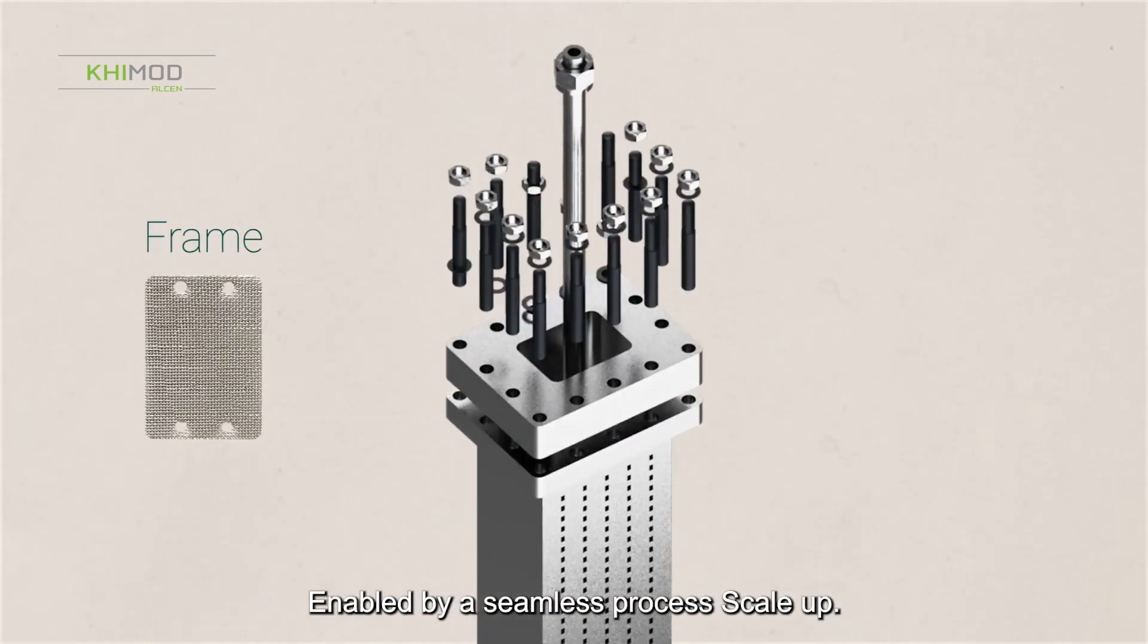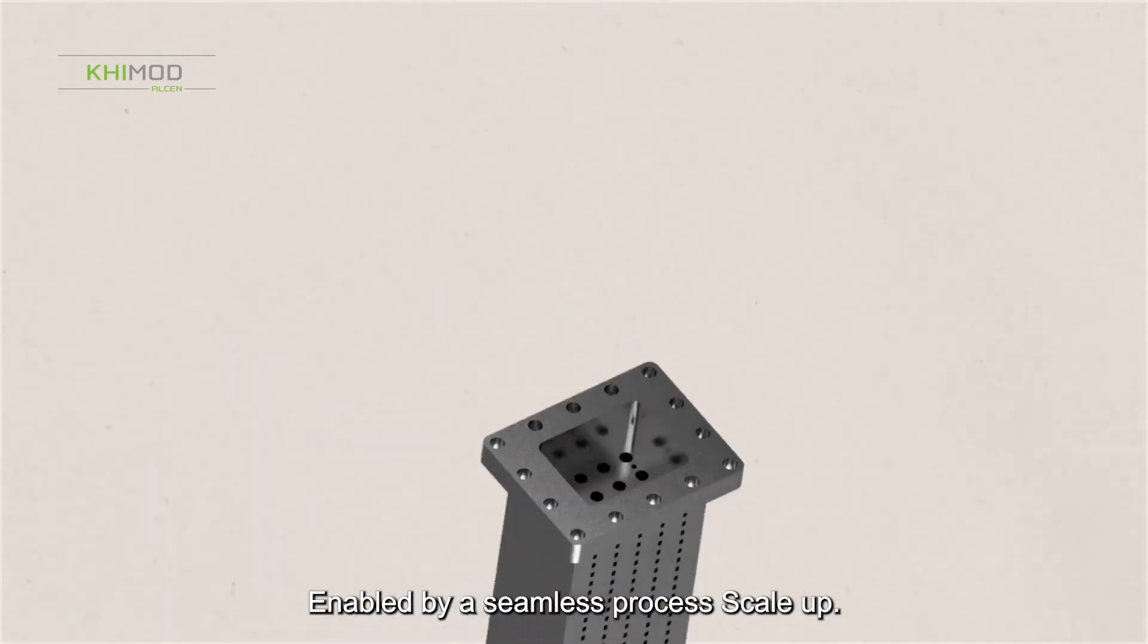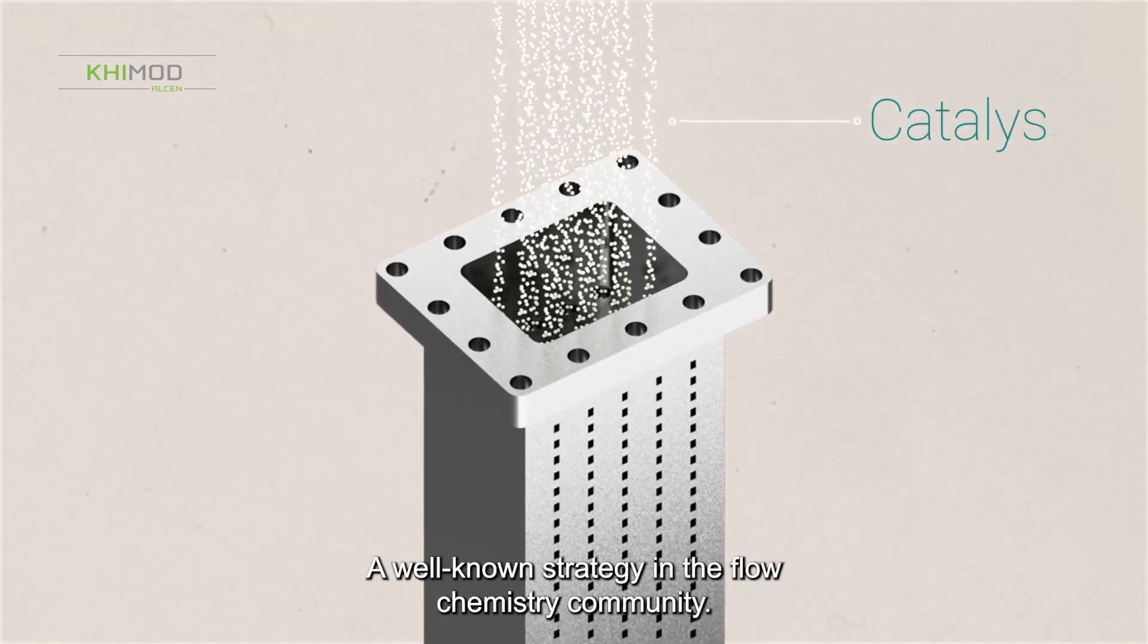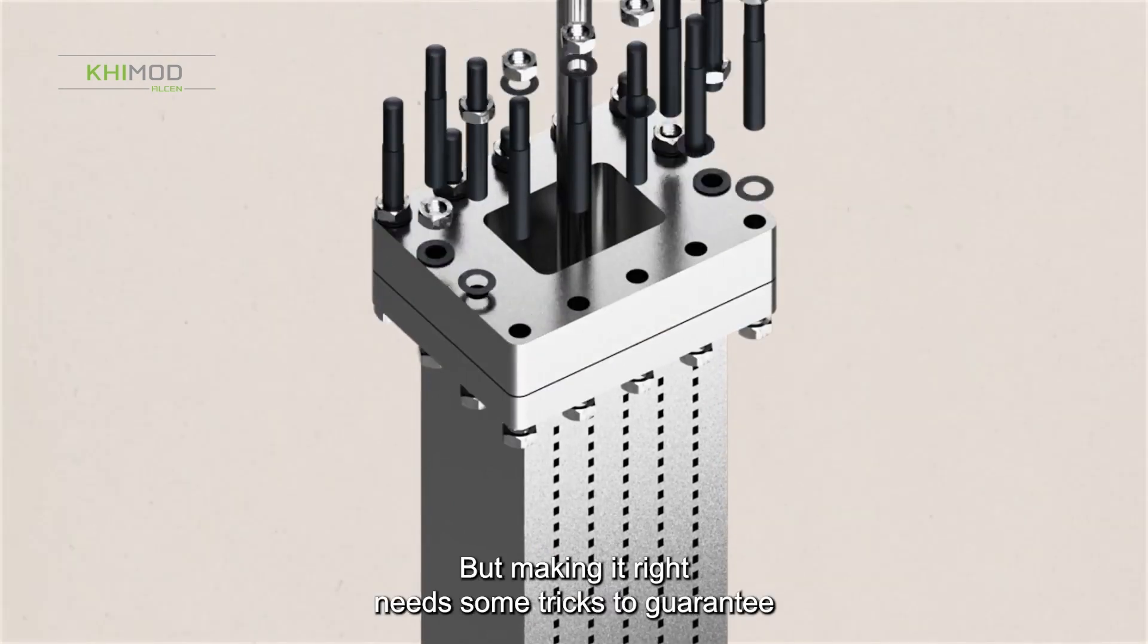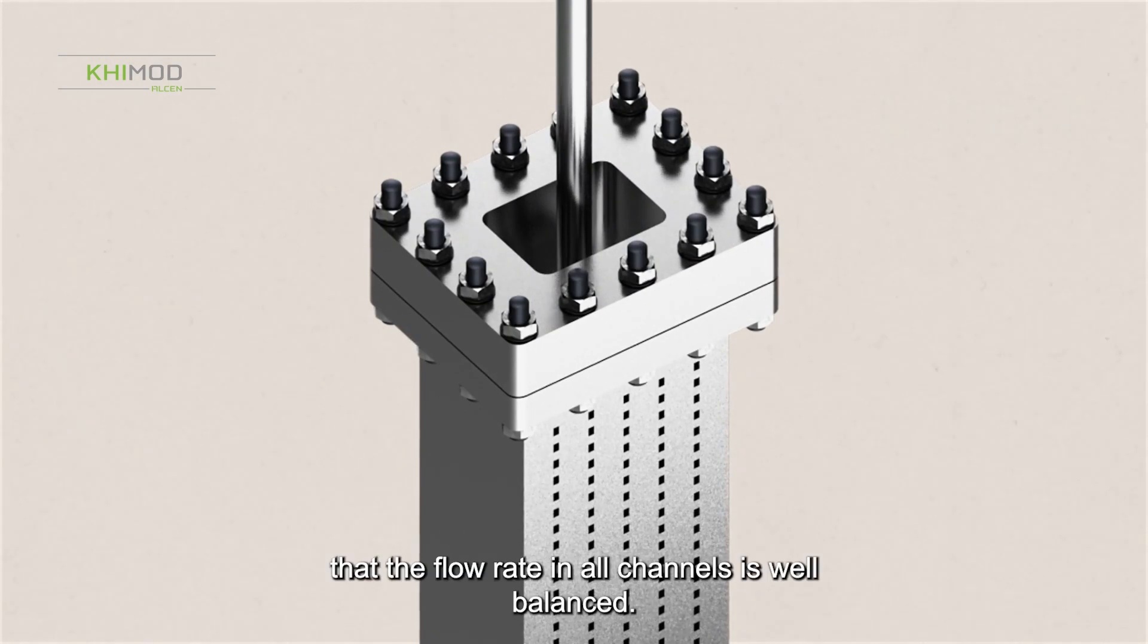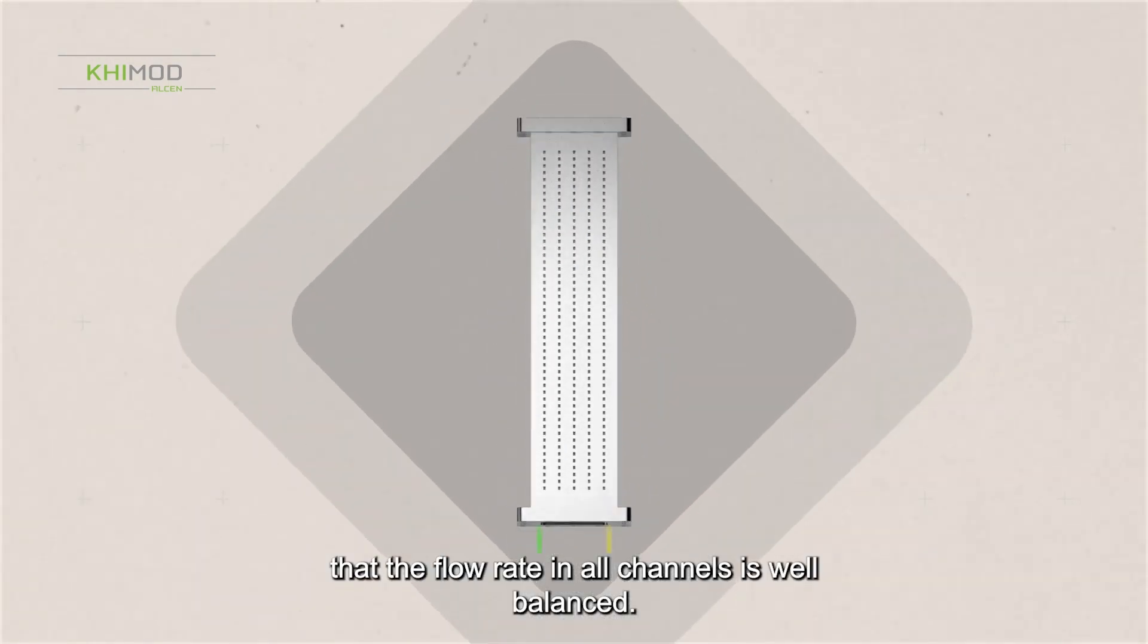Shorter time to market, enabled by a seamless process scale-up. Numbering up, a well-known strategy in the Flow Chemistry community. But making it right needs some tricks to guarantee that the flow rate in all channels is well balanced.